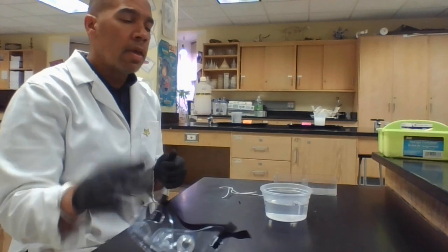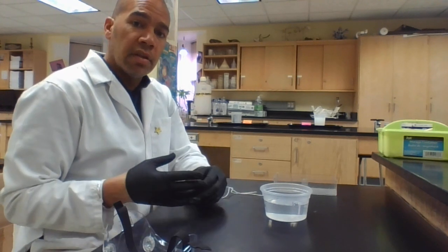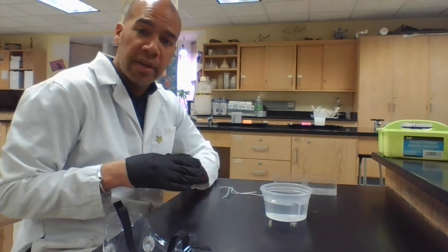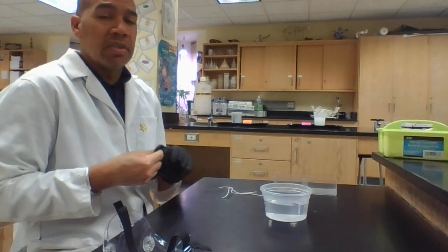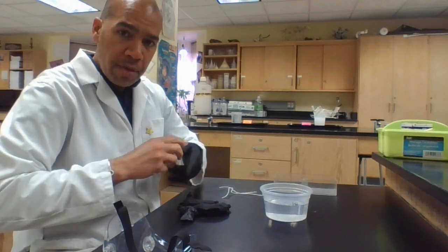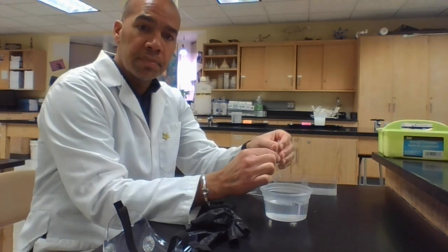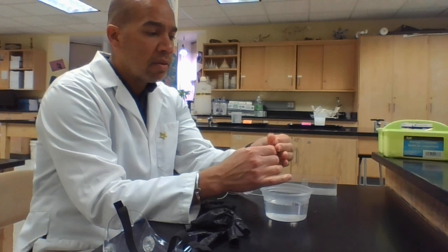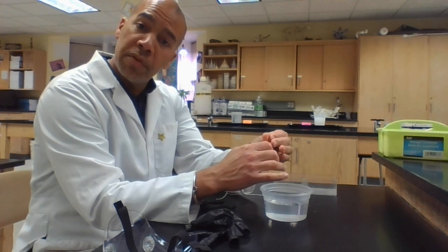Okay, so we're back at our seat, and right now I am going to try to manipulate this little piece of dialysis tubing to see if I can open it up. Kind of like you need to open up those fresh trash bags that you have from the store to be able to put into a little trash bin at your house. You're going to do the same thing. You're going to kind of twist back, like rub back and forth to try to get it to open. And sorry, my gloves are giving me issues. So I'm going to take it out of the water, and I just start to rub back and forth, okay? Until I get a little opening in the top. Waiting a few seconds.